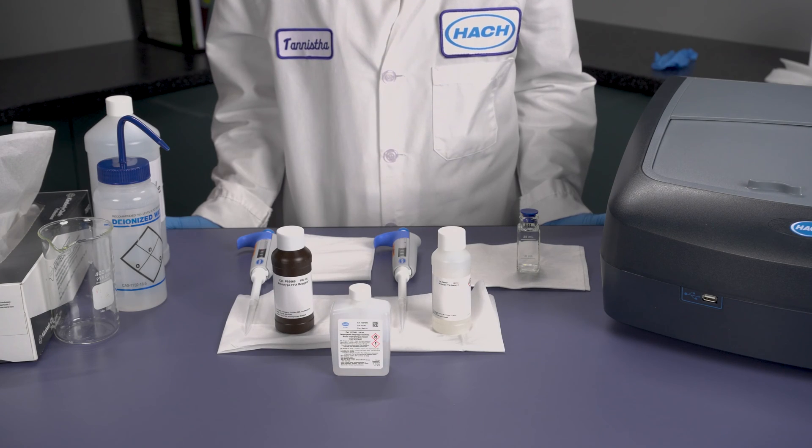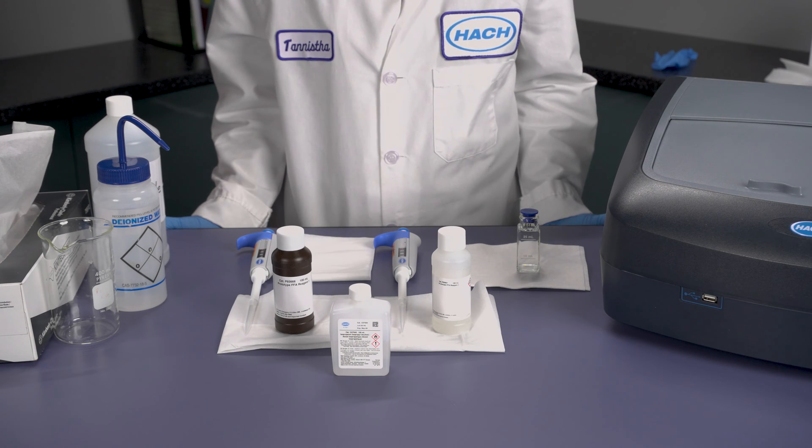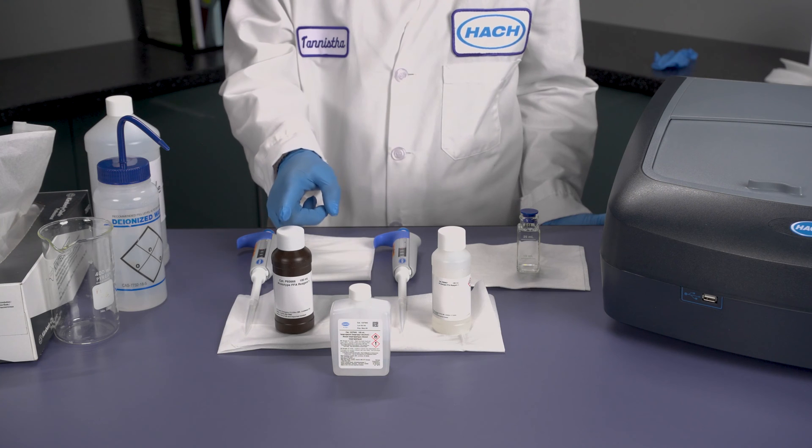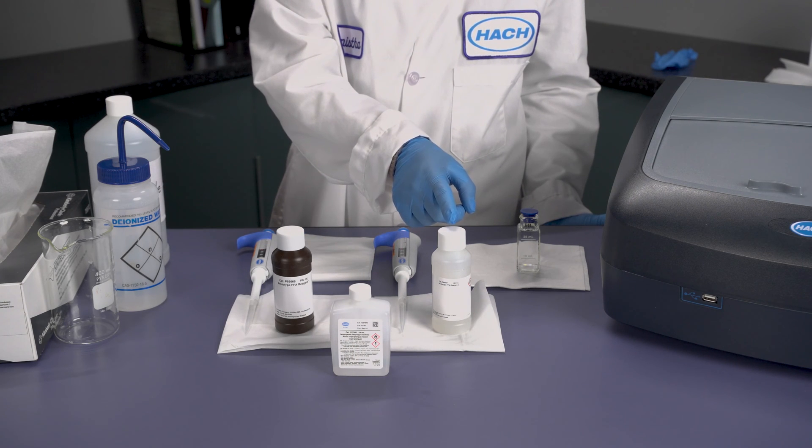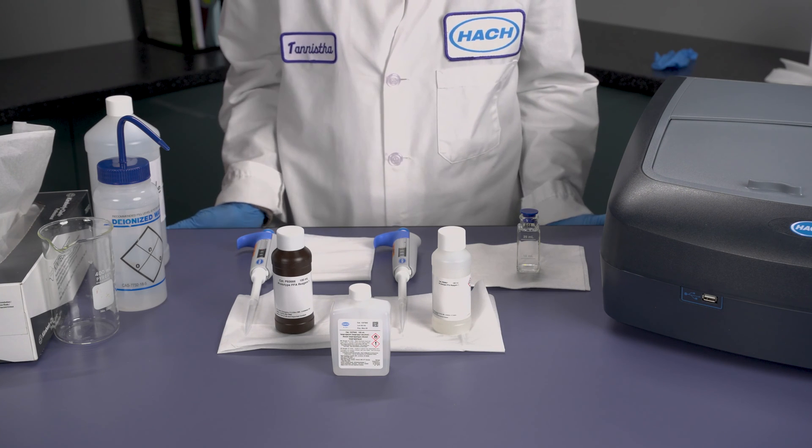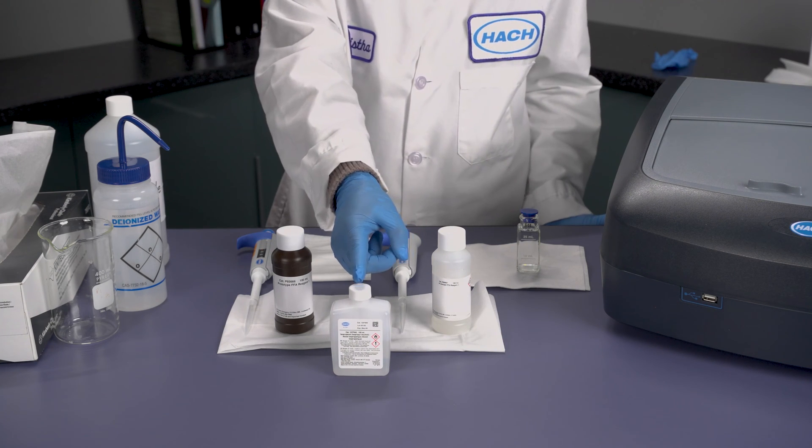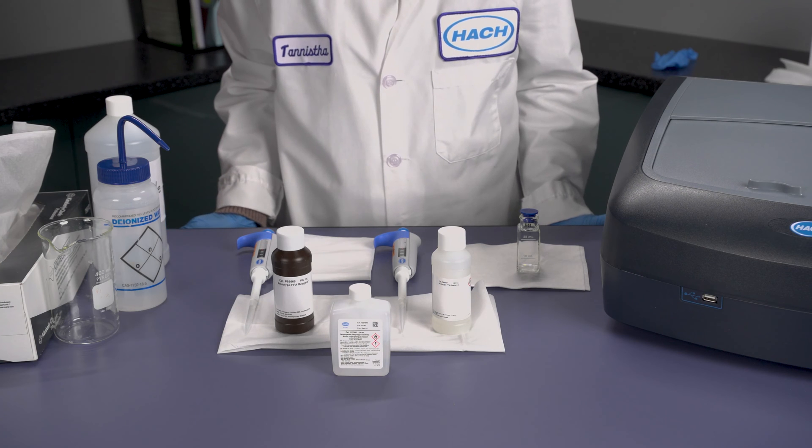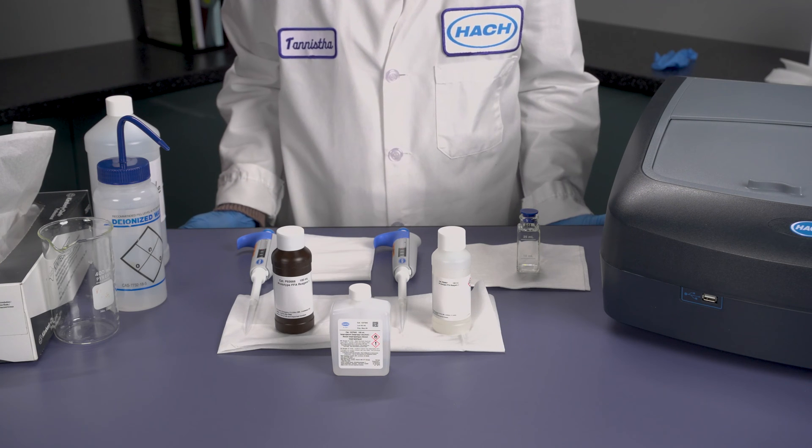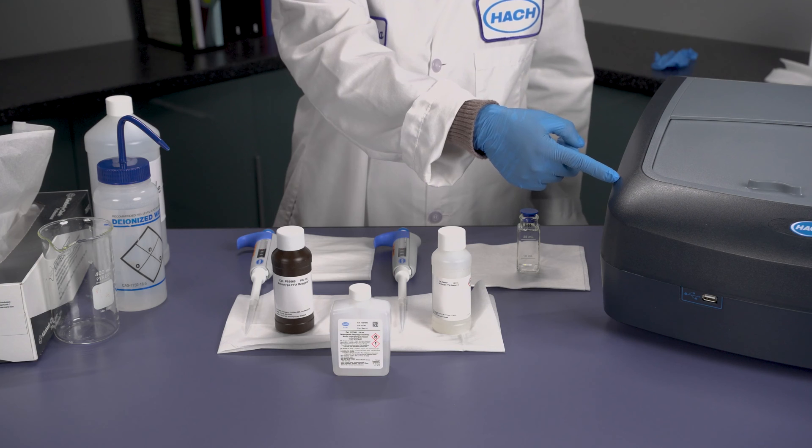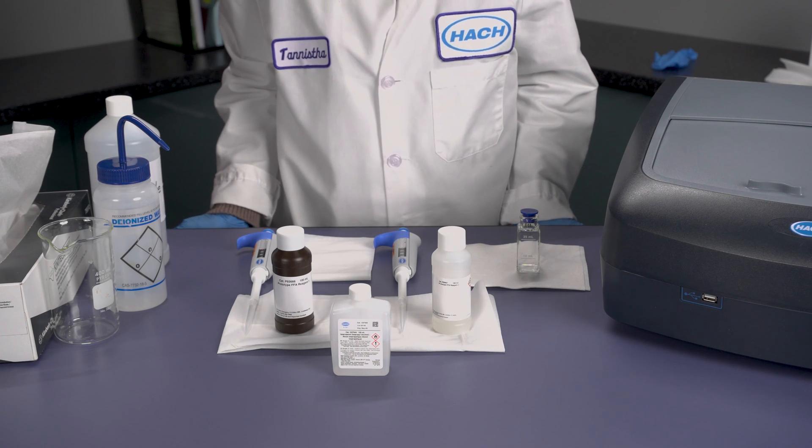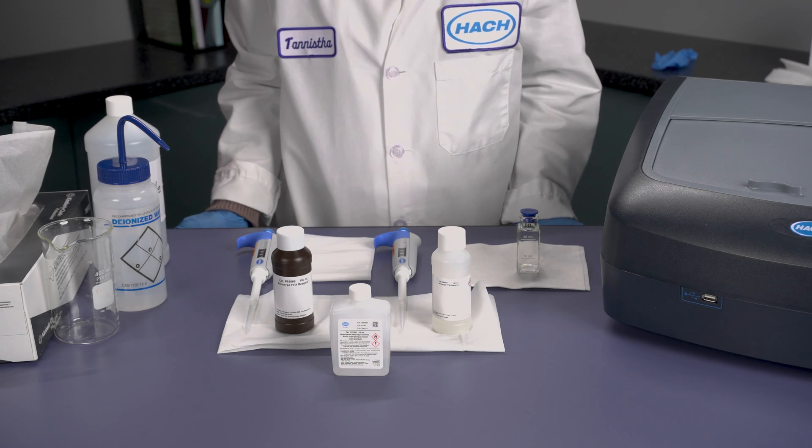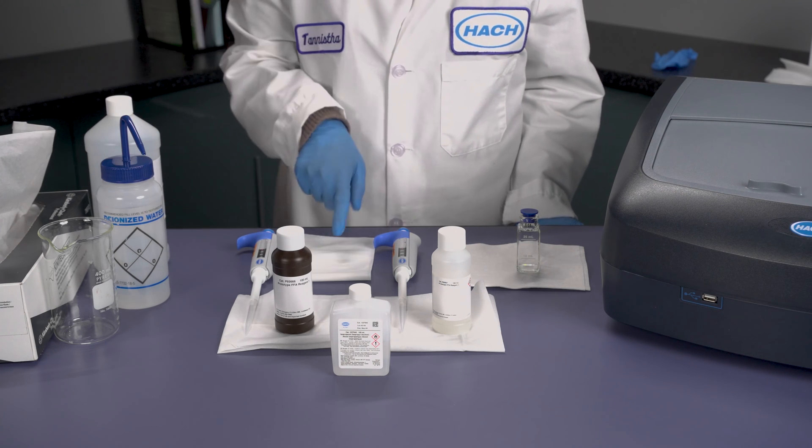Let's discuss the labware, apparatus, and reagents utilized in this method. There are two reagents that are used for the test: film forming amine 1 and film forming amine 2. However, there's also the isopropyl alcohol solution that is used to clean the sample cells between tests. You also need a spectrophotometer. We recommend a DR6000 spectrophotometer from Hach or the DR3900. In addition, you will need deionized water and chem wipes for cleaning the sample cell.